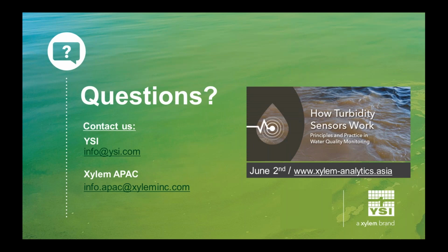That's a great question, Michael. Thank you, Stephanie, we've actually received quite a few questions about calibration. So let's select one of them. Which calibration solution should we use for chlorophyll calibration?